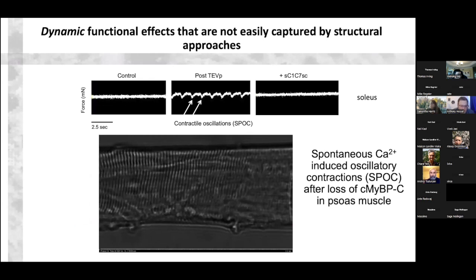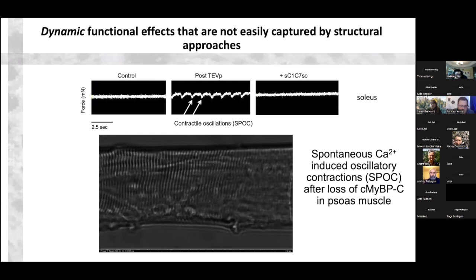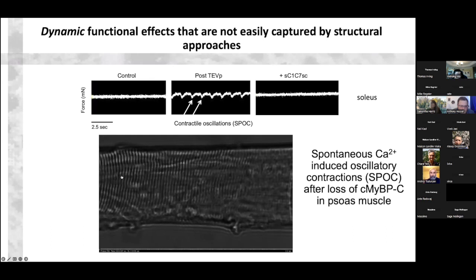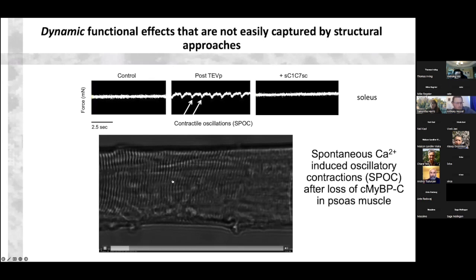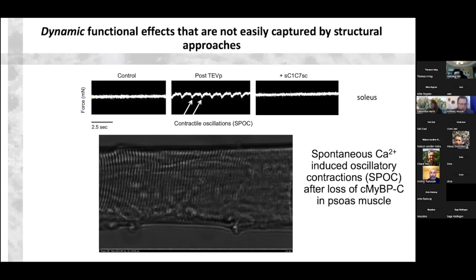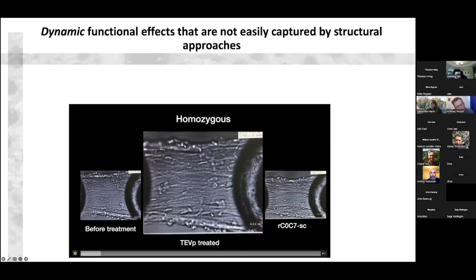I don't know if you can see it all that well. The movie is supposed to loop, but under conditions of activation, where normally you would have just an isometric contraction, in the absence of myosin binding protein C you get these waves of contraction that occur across the muscle fiber and stay as long as you're activating with calcium. I think this is shown a little bit better in this cardiac movie. What I want you to know is that there are three live videos going here, but only one is going to look live. That's this middle one, where we've treated with TEV and lost cardiac myosin binding protein C.